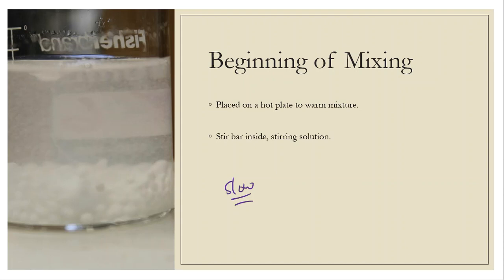And at that point, you need to take it off. So for that reason, I don't really need to record any type of temperature. That's what I'm getting down to. We just need to heat it enough so that this stuff will dissolve, and then I just need to take it off of the hot plate.